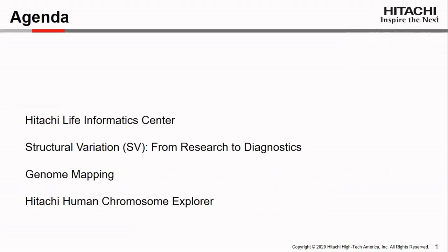In this presentation, you will be introduced to Hitachi's Life Informatics Center and the opportunity we see for genome mapping and structural variation analysis in both research and clinical applications. I will also demonstrate our whole genome map assembly and structural variation analysis pipeline called Human Chromosome Explorer.